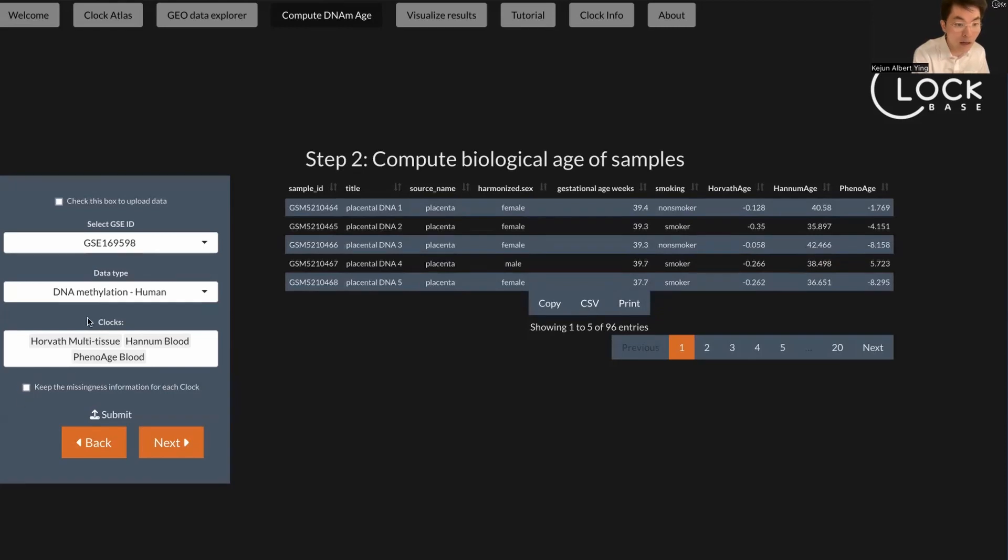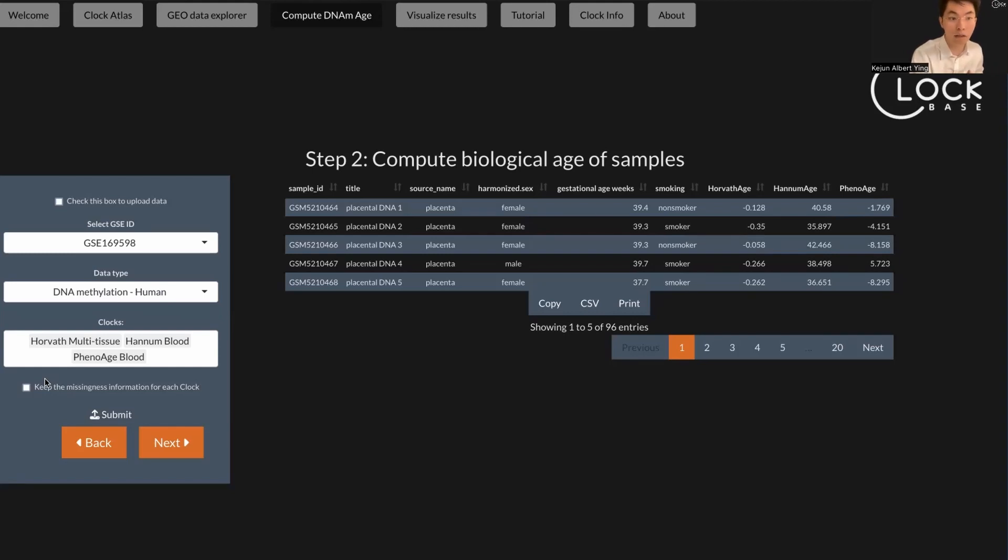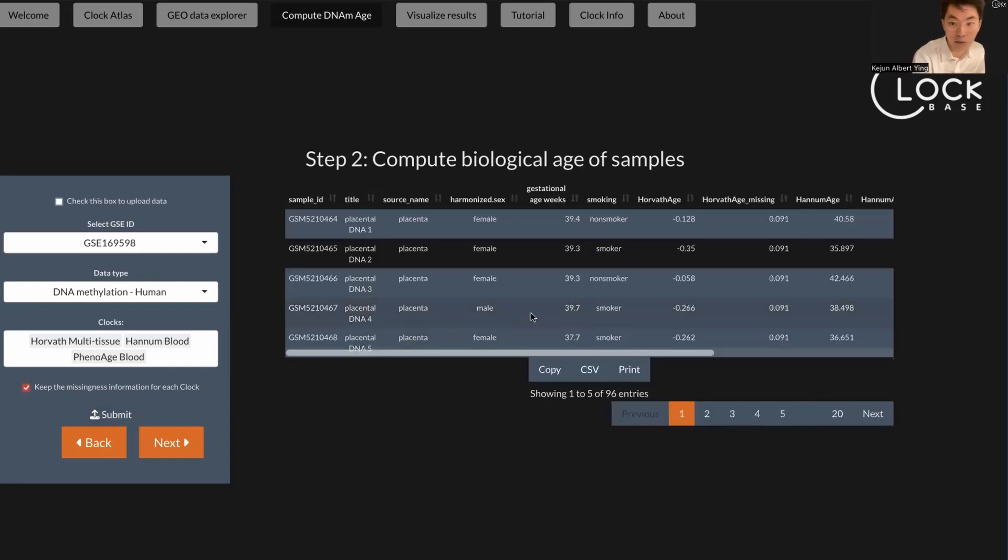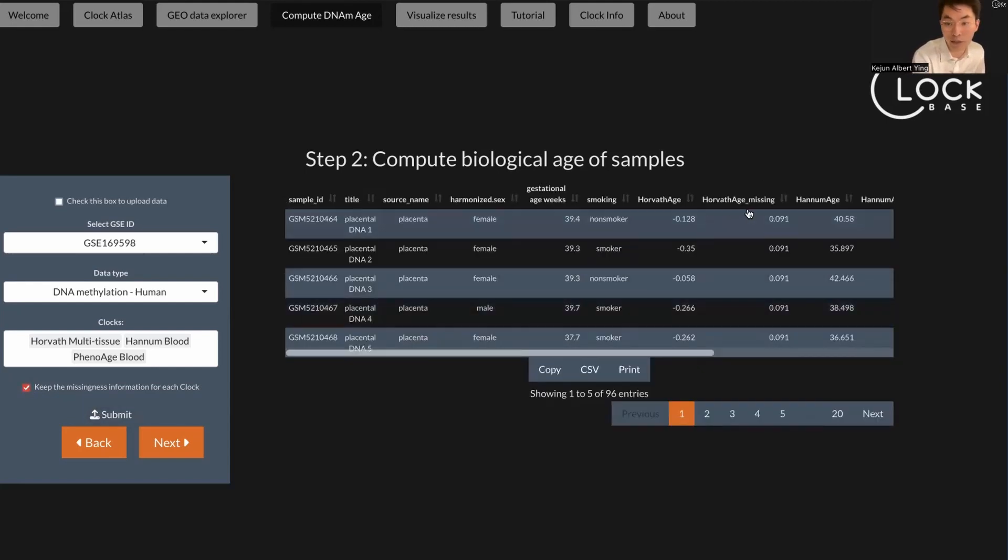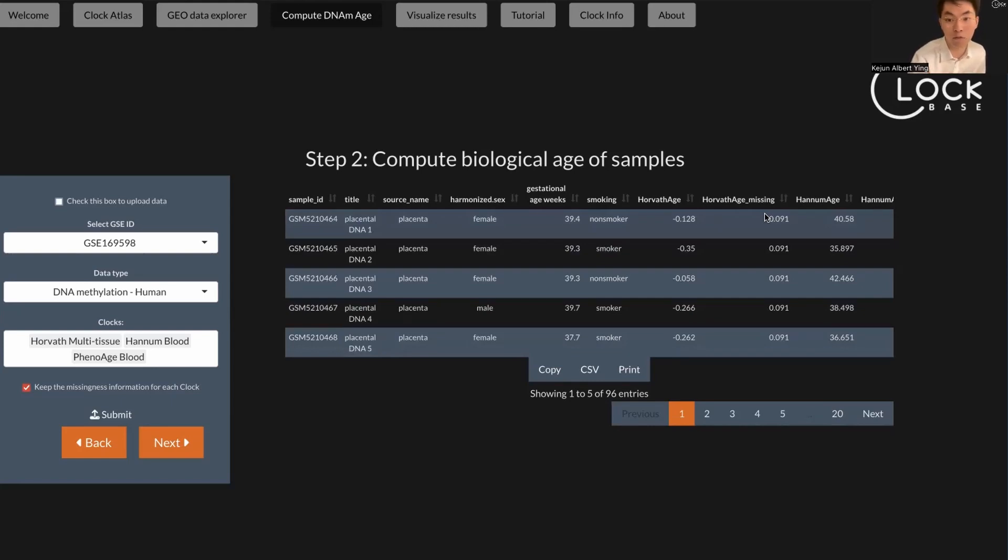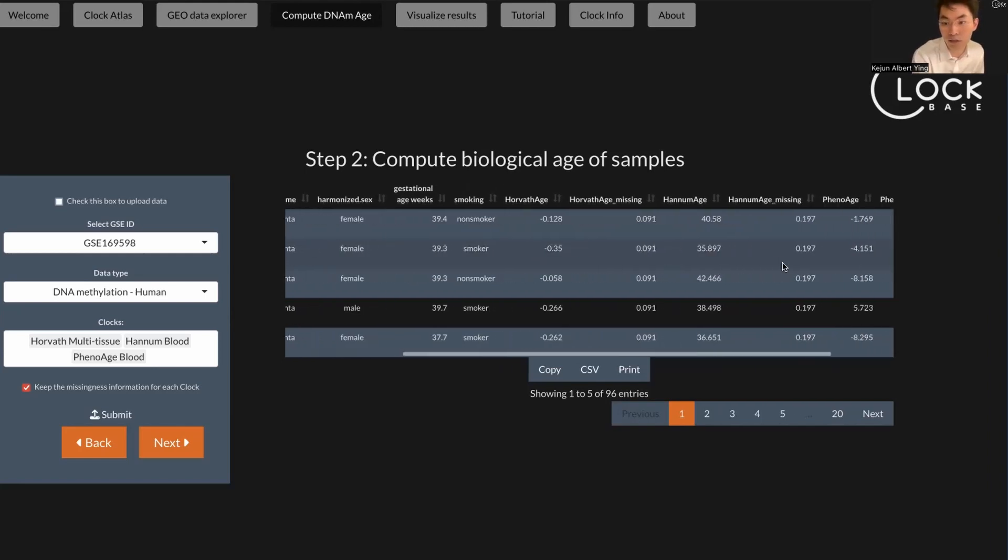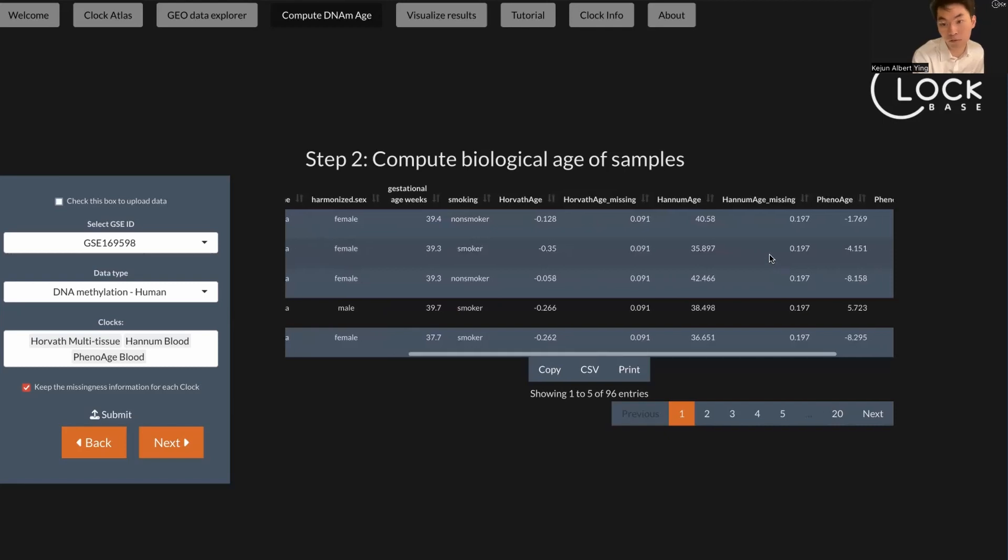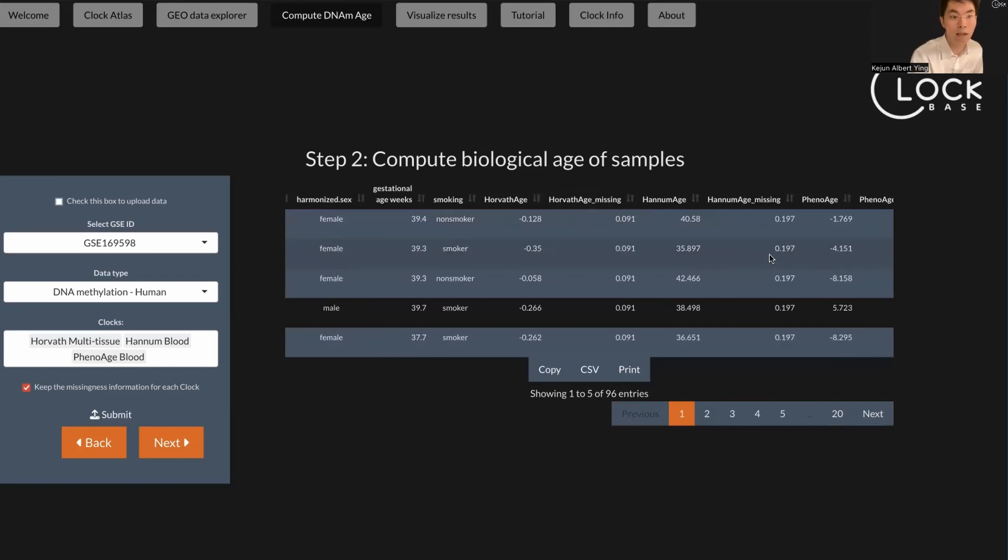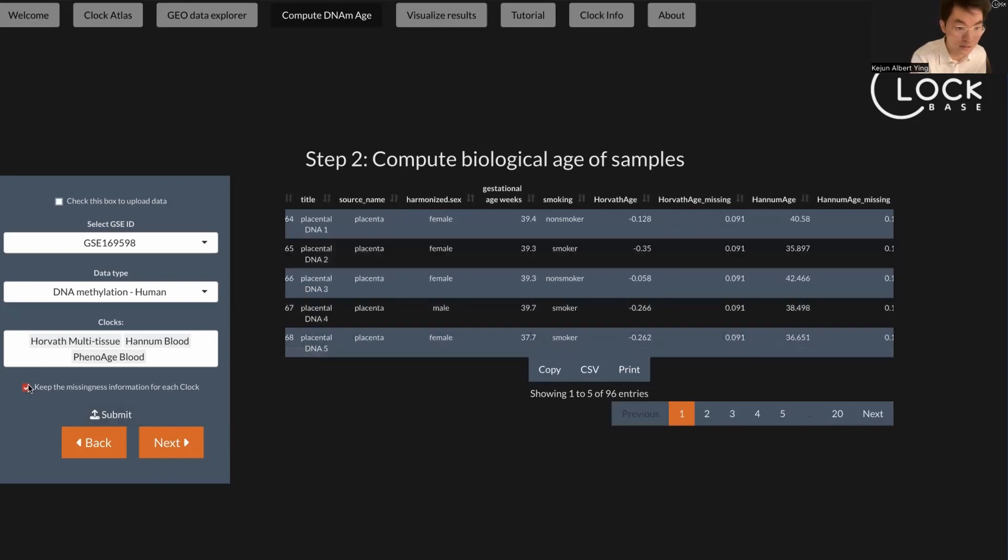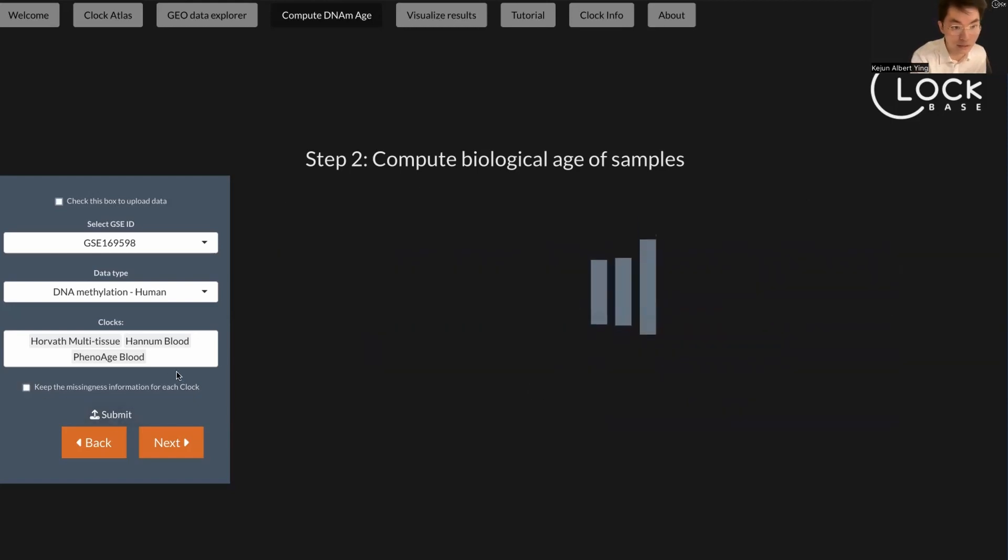One thing to know is that if you worry about whether the CpG sites in a clock are missing in a sample, you can click on this box and it will show how many percentage of the CpG sites are missing for the given clock in this given sample. As long as this number is smaller than 0.2, it should be fine. It means that you have at least 80 percent of the CpG sites in the clock covered in your sample.